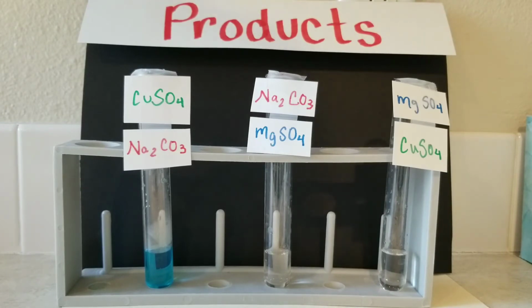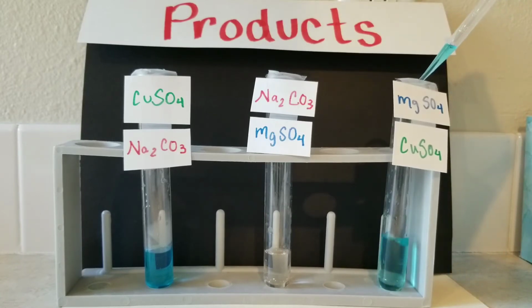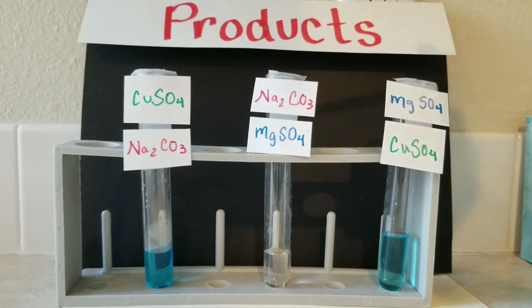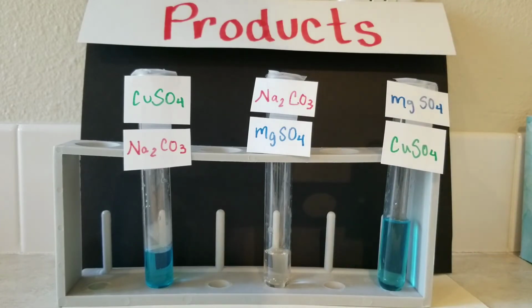And you're remembering to look for those indicators that we talked about in lesson 8. And I want to have a 1-to-1 ratio here, so I want to fill up the test tube with as much of the liquid as I started with.